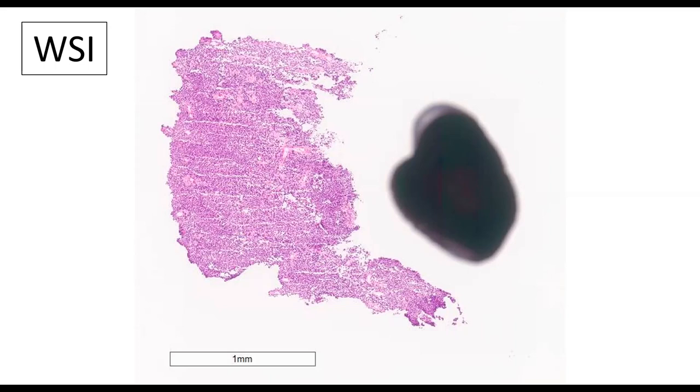You have to cut all the sections now. Or if it's already in formalin, you have to have your main histology lab cut 40 sections at the same time they do the screening H&E. If you just let this go and wait till tomorrow morning, the FFPE block goes to the main lab, they cut the section, you look at it and say, oh yeah, I think I know what this is, I need two immunostains. They have to remount the block and face it, which means make it level again. All the tissue's gone, you get nothing. You get back all of your immunostains as just antibody on glass. Everyone understand? You have to protect the patient.